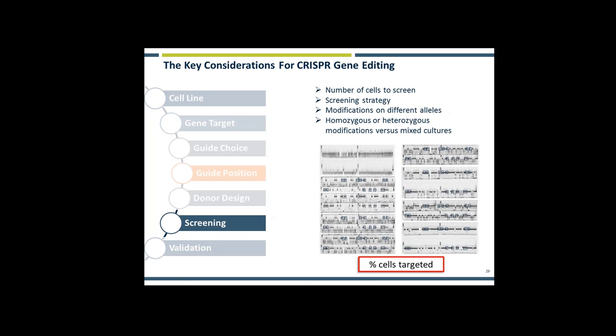So for example, if you have an optimized Western blot protocol, maybe you're set up for immunofluorescence microscopy, maybe flow cytometry if you're looking to knock out a cell surface protein, or even ideally, if your knock-in or knockout confers some kind of drug sensitivity or resistance or some kind of morphological change, all of these things can serve as potential markers for clones that have undergone targeting events.